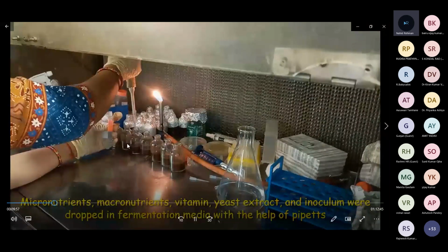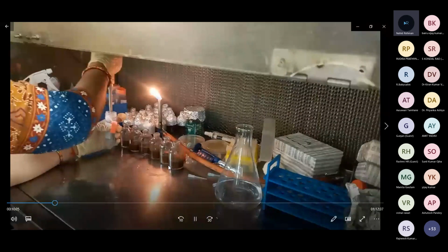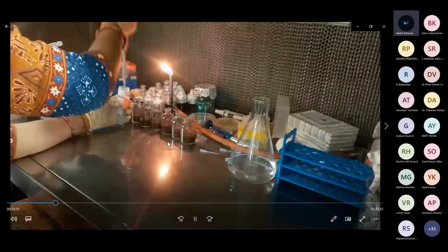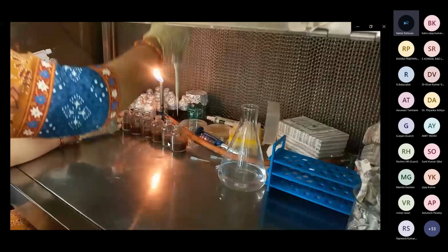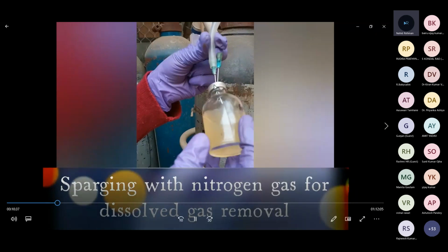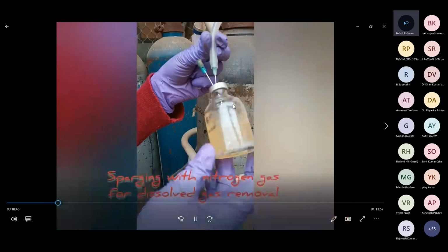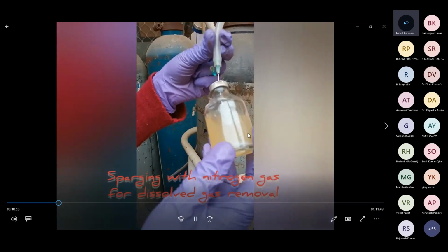And after adding the micronutrients, she will add the 18-hour-old culture of bacteria. She is working on a strain of Bacillus. Bacillus is a very robust microorganism. It is a spore-forming microorganism. So it gives a very high yield production of hydrogen. After that, one has to put the cap, and then you have to put an aluminium cap over that. That actually makes it airtight. After that, she is sparging the nitrogen gas into this bottle to replace the air which is present in this bottle. Usually, we are keeping it 1/4.